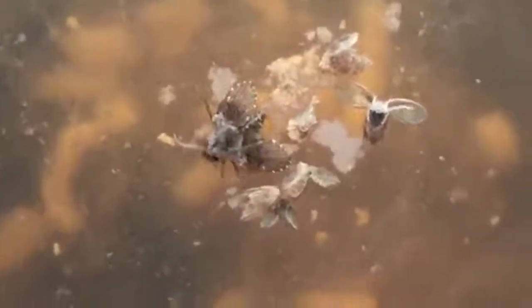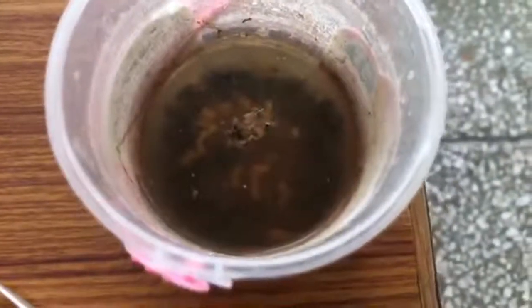So it is this thing that we are going to see. Oh, there's an insect. There's a larva. And these are becoming food for the various amoeba.